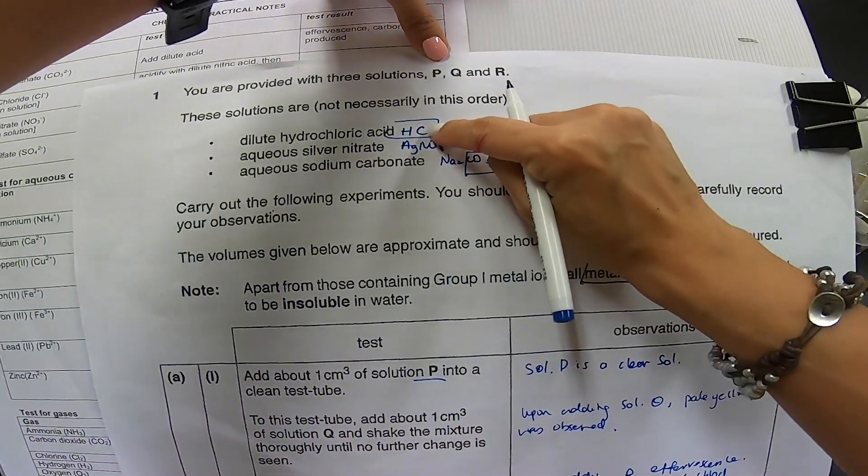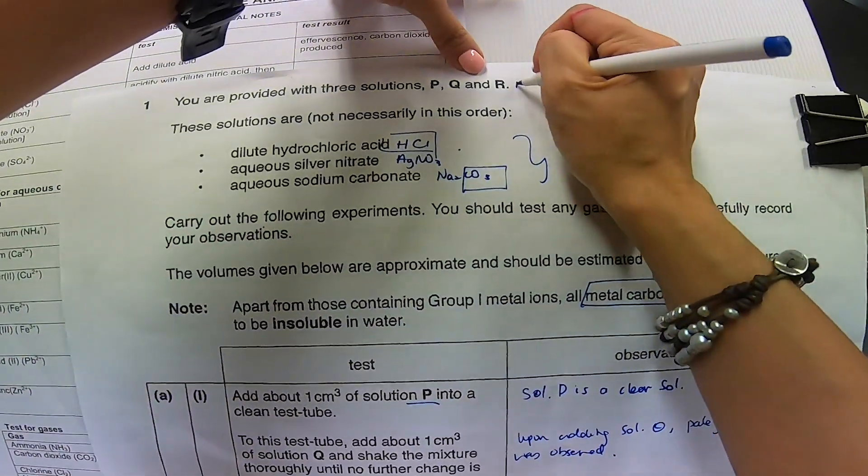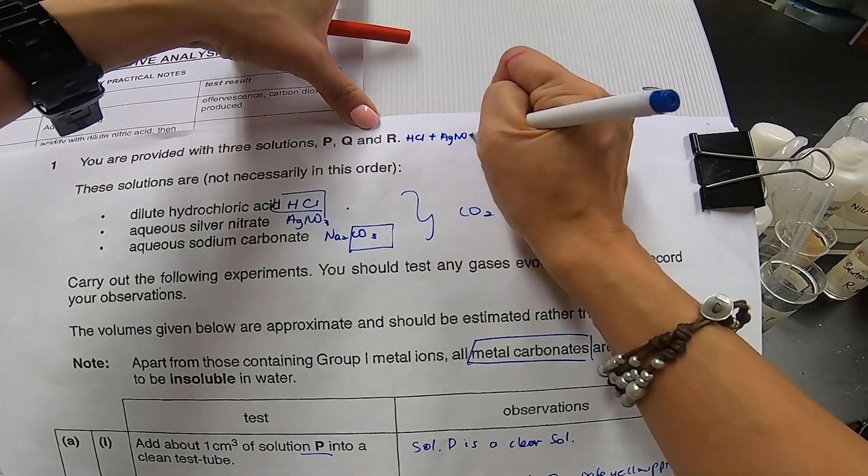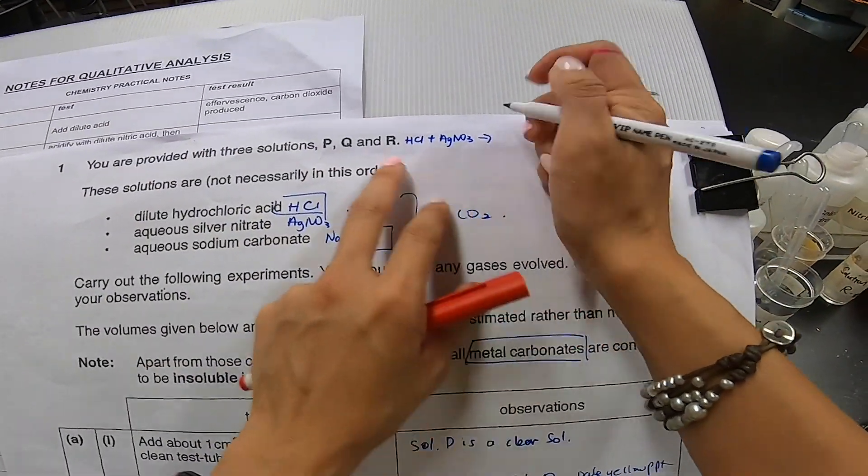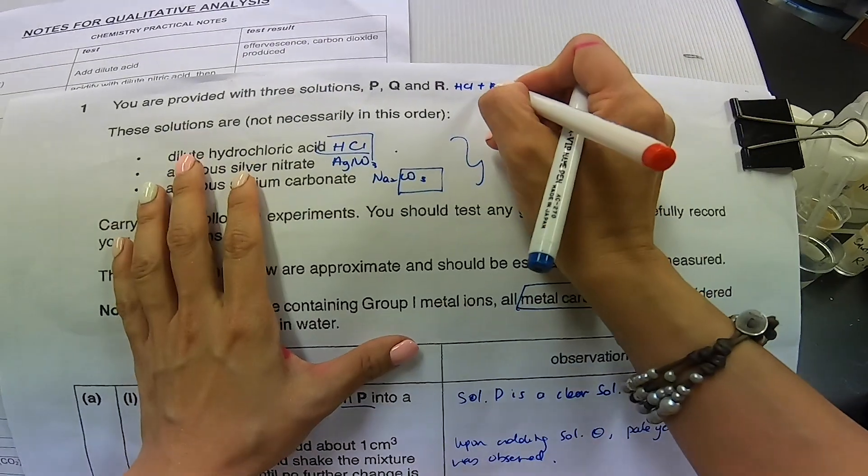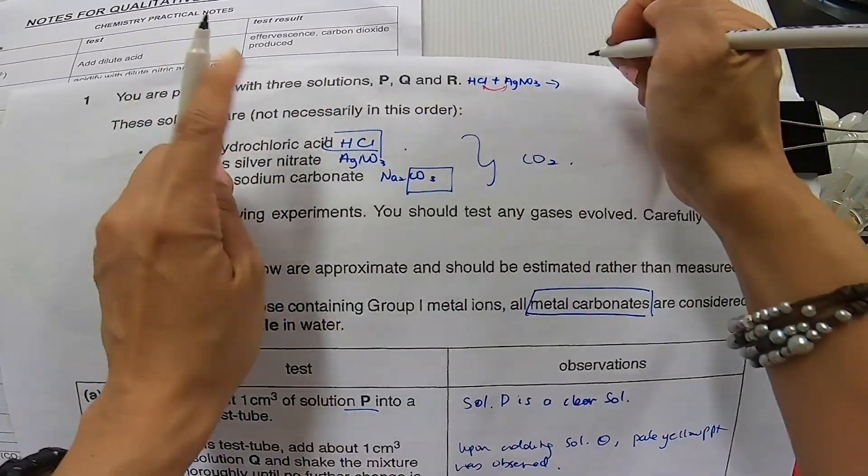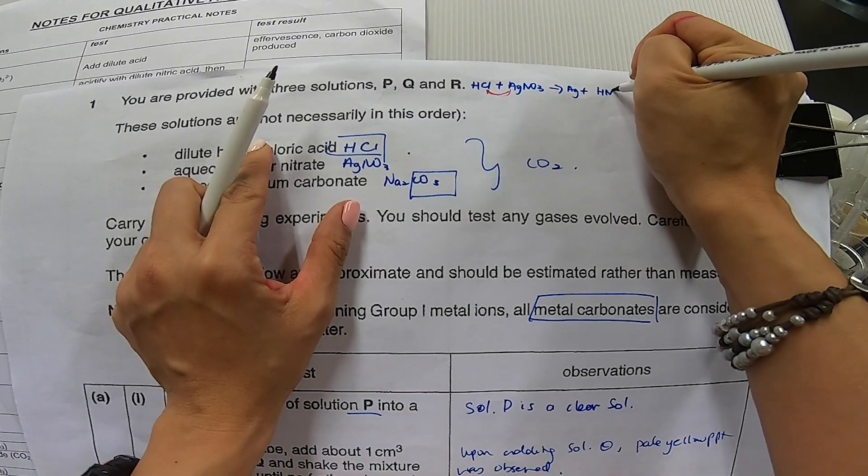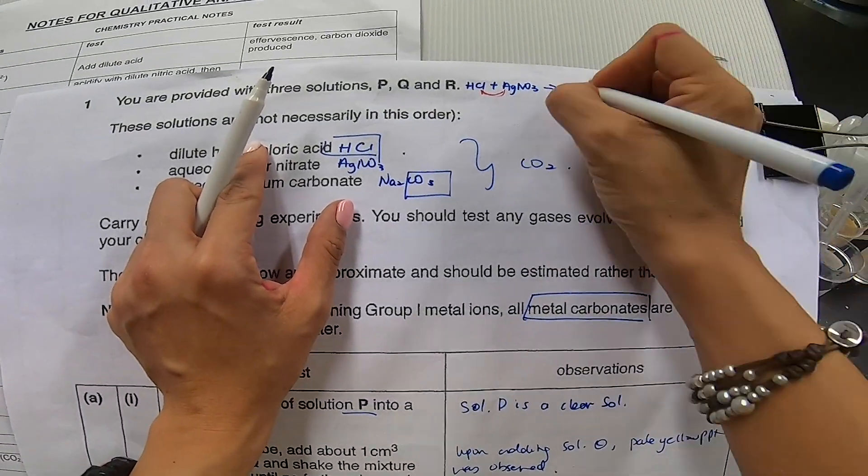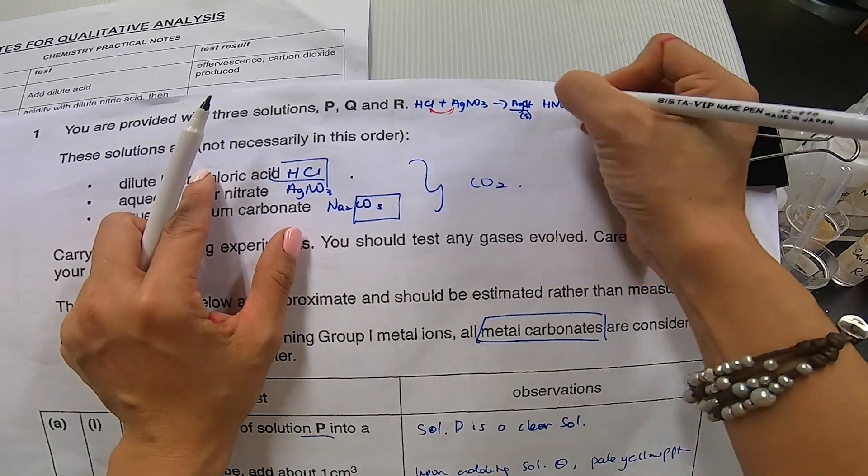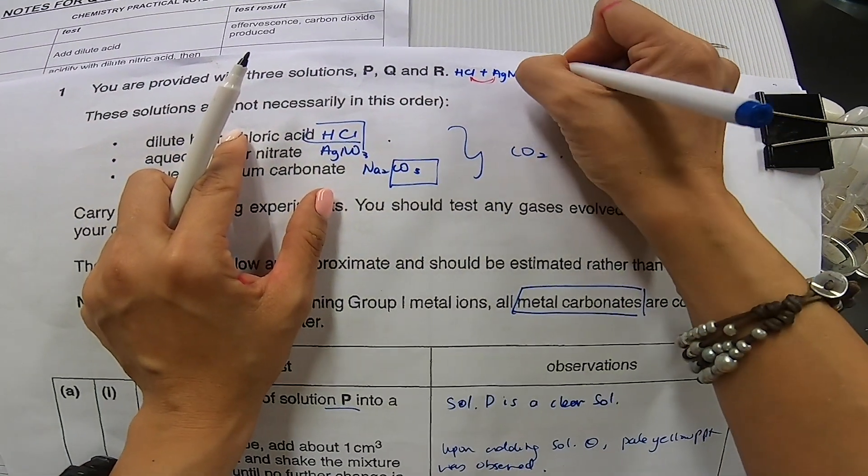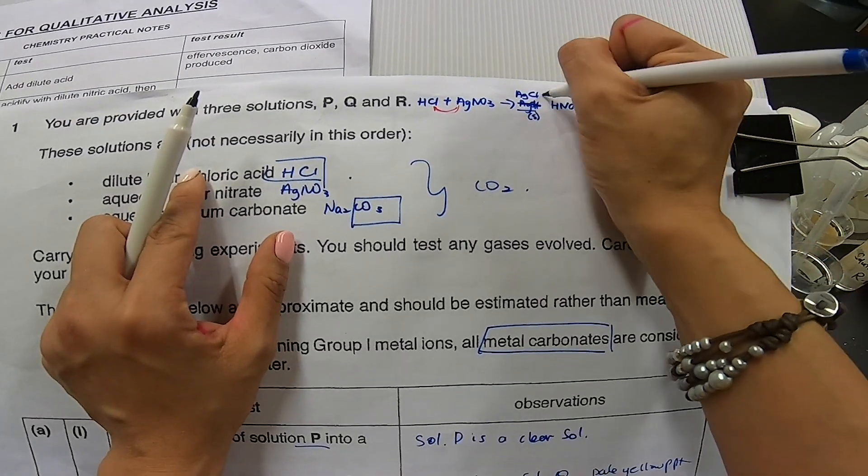So imagine you use the HCl react with silver nitrate. So I'll write HCl plus AgNO3. Then you will get, this is actually a precipitation. You will actually be able to see them exchanging partners. So I will have AgCl plus HNO3. This is HCl. I hope you can see over here. So this is actually a solid state and this is aqueous state. Why do I write down a state symbol? So that I know exactly what to look for. So I'm going to clean this away so that I can make it much clearer.